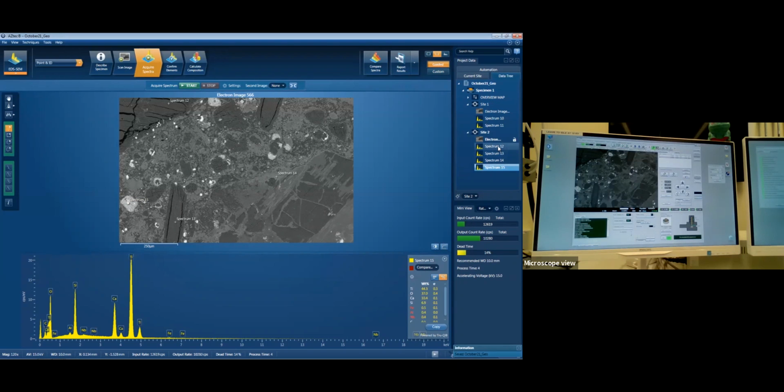So we have those 4 points loaded in now. This last one over here is a little bit interesting. We've got that titanium back again, but we've also got quite a lot of calcium. When we see a bit of a weird spectra, a weird composition, we might zoom in to get a better idea of what's happening, especially because it looks like here we've got some little white patches and some slightly darker patches. So there could be something weird geologically going on here. But what we might also do is do a map.